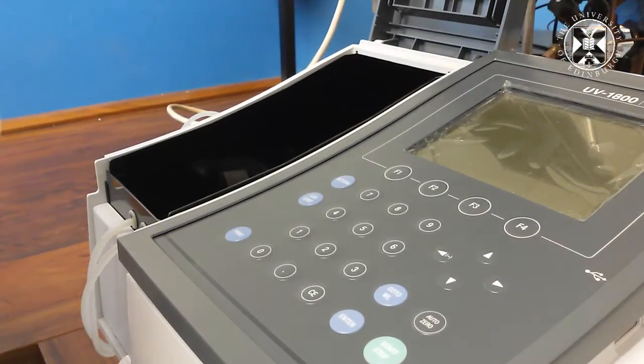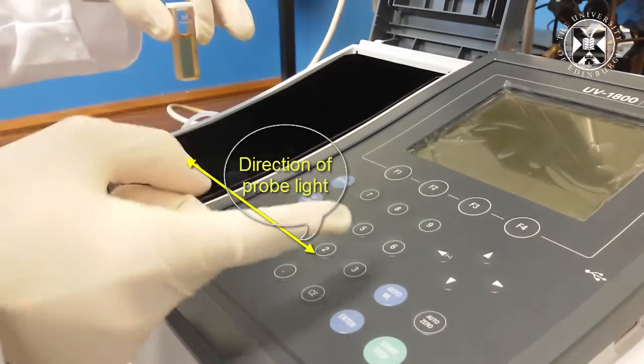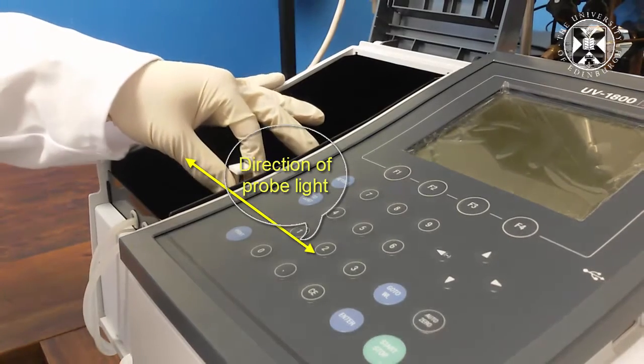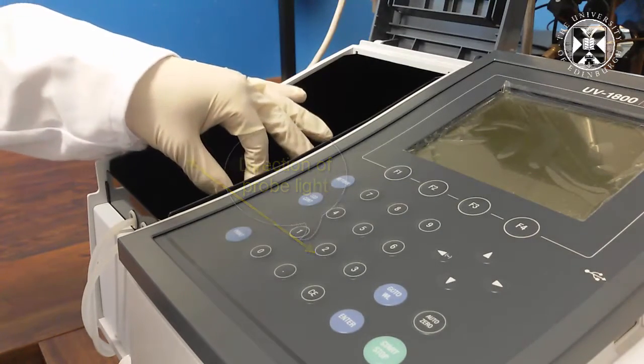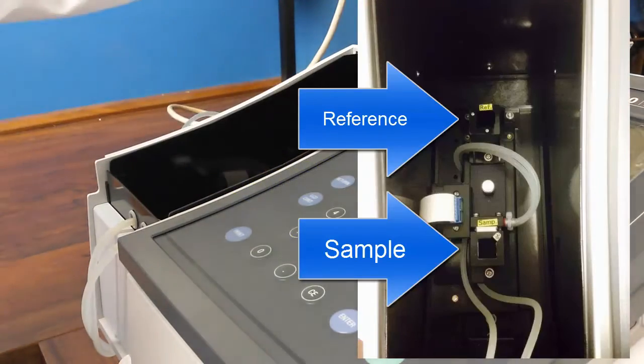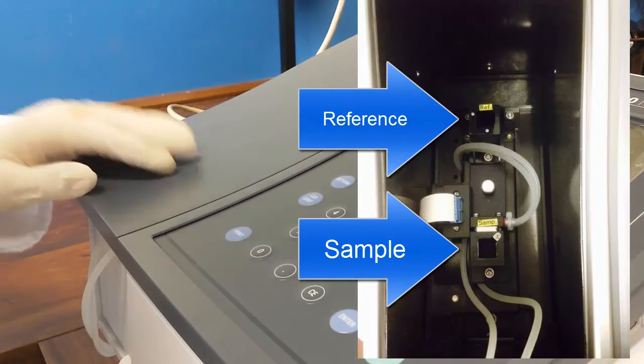To insert the sample into the spectrometer, open the lid and make sure the clear sides are going in this direction. Place it in the sample hole, which is shown in a picture in the pre-lab. Then close the lid to record the spectrum.